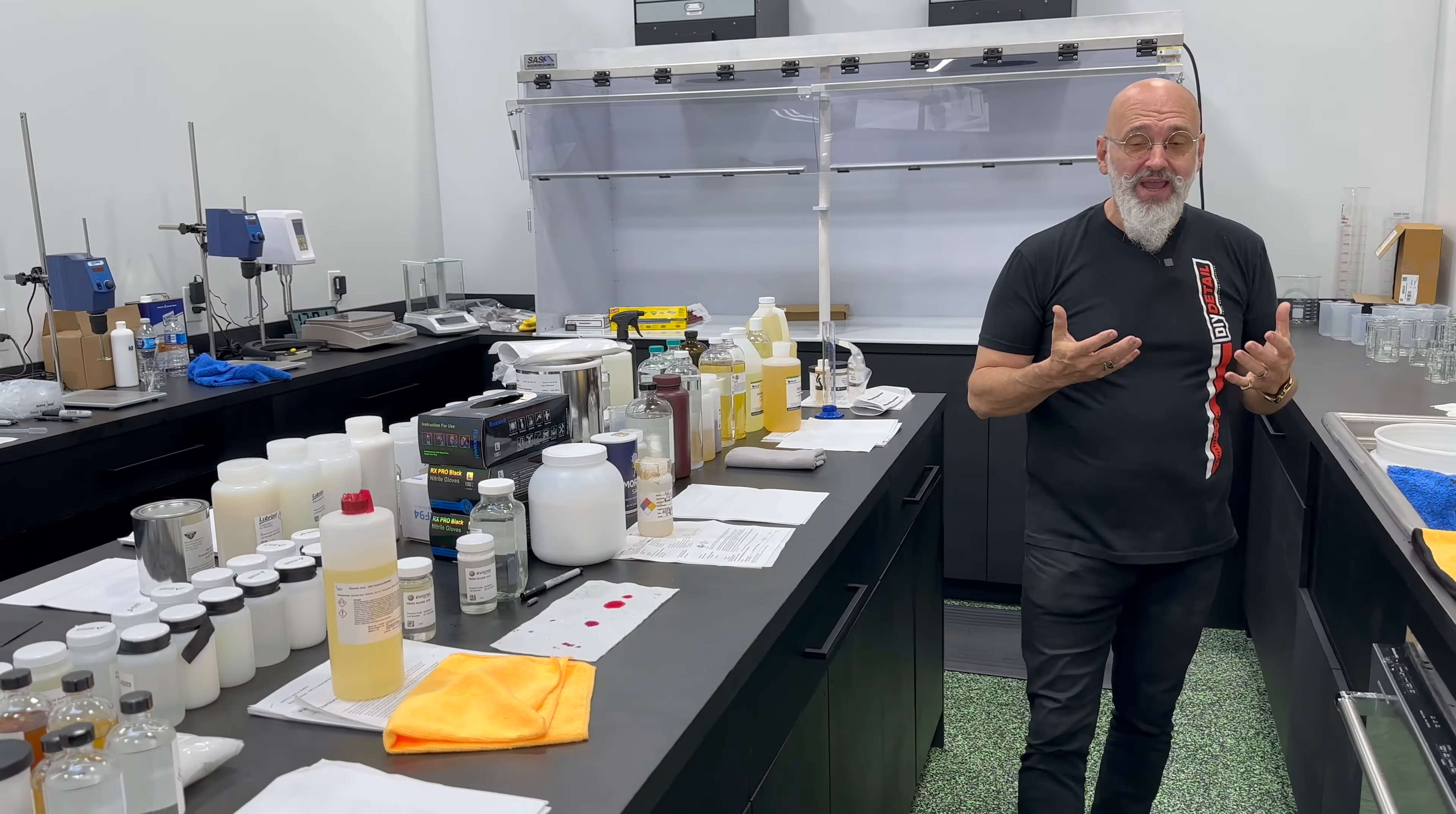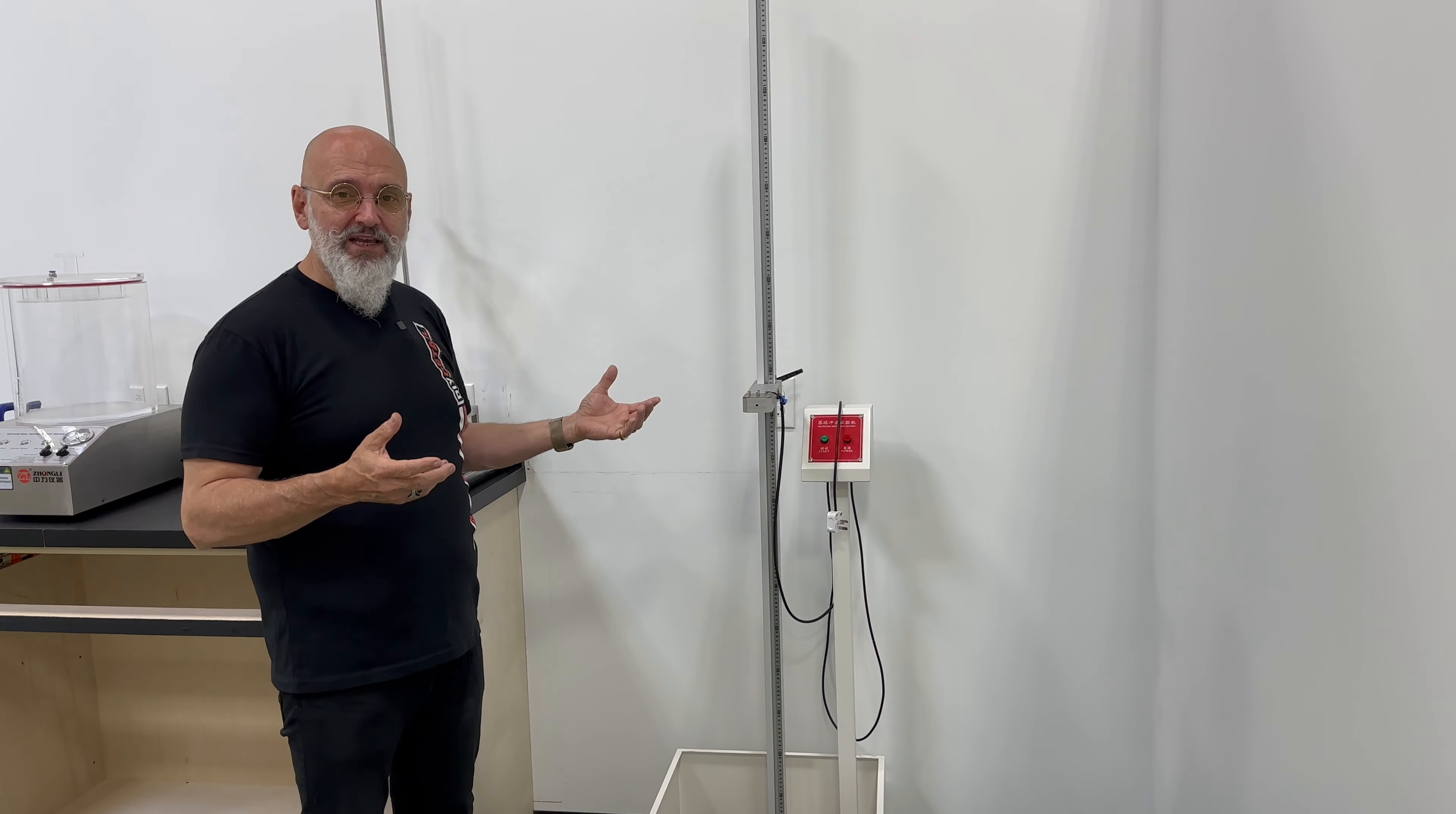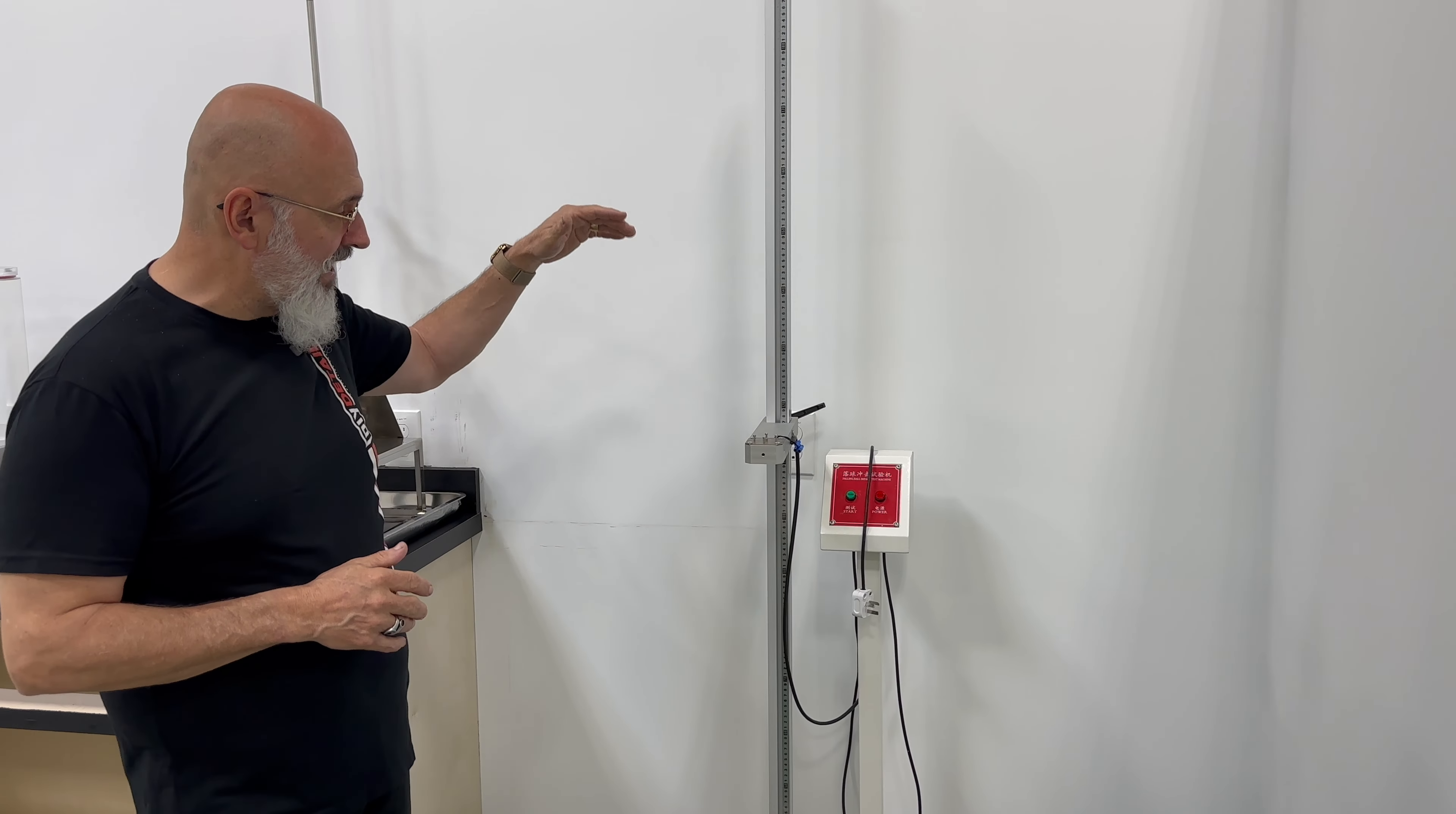This one here is an interesting one. This is a drop tester for glass. So you have a window. You want to see if the coating is actually changing something on the window. This is how we test it. So it drops from a certain height, certain weight, et cetera. We're not using that one yet.